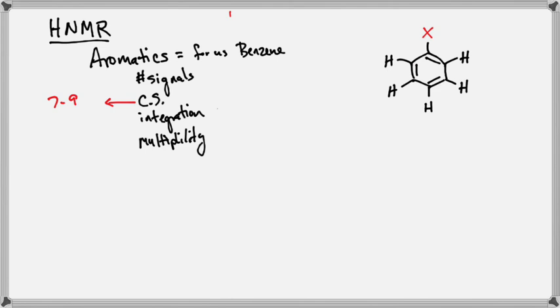That placement is dictated by the specifics of how many signals I have and multiplicity. What I'm trying to do is ignore the specifics. If my integration comes in at 4, what does that tell me? 2 4s. There's 2 things connected to the ring. That's it. Again, very, very fast.